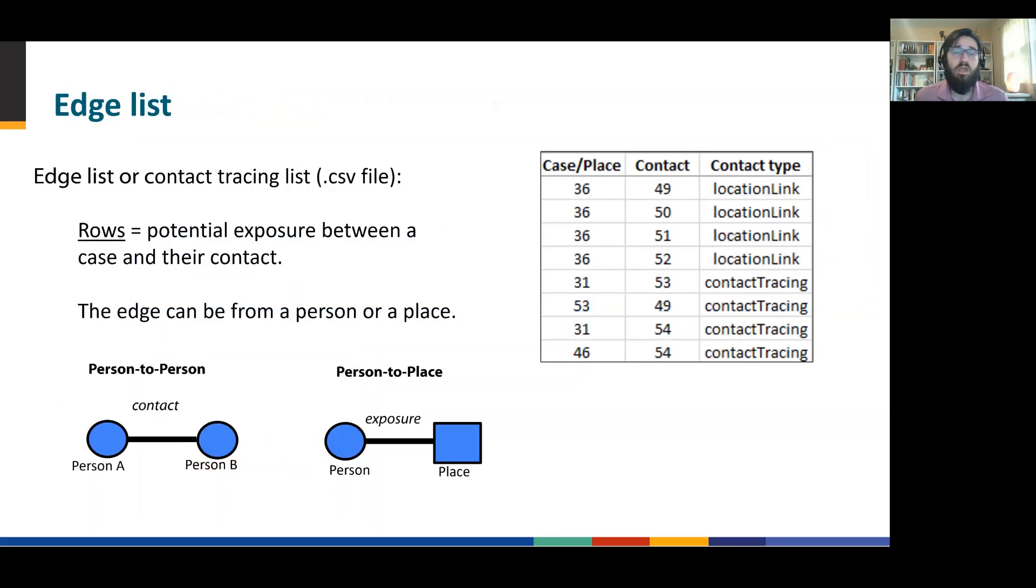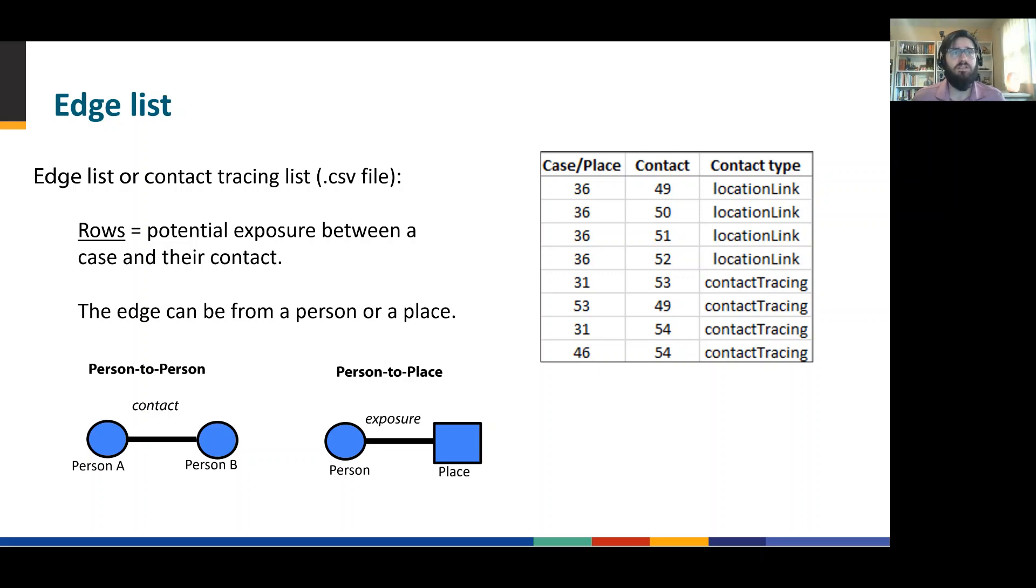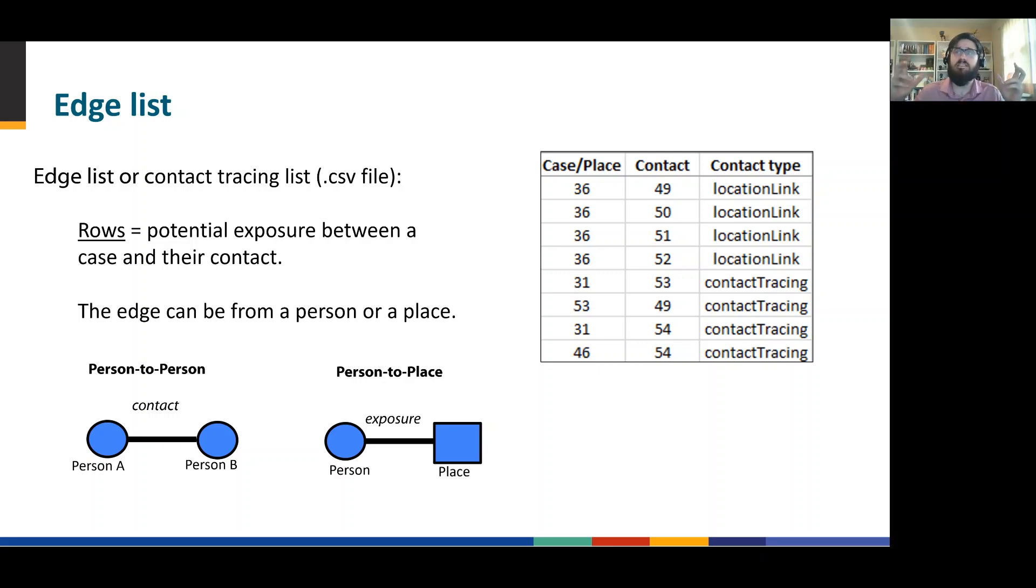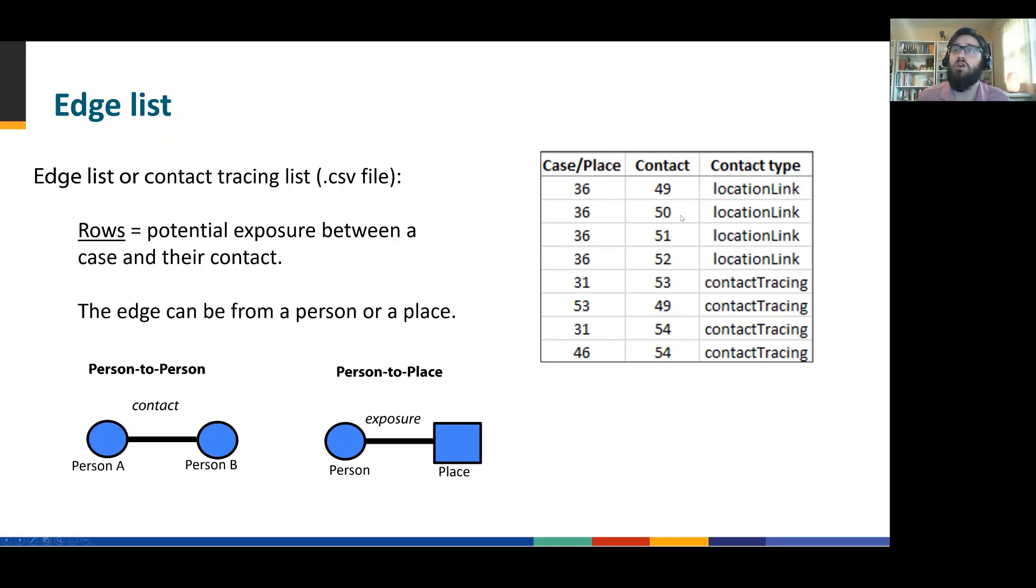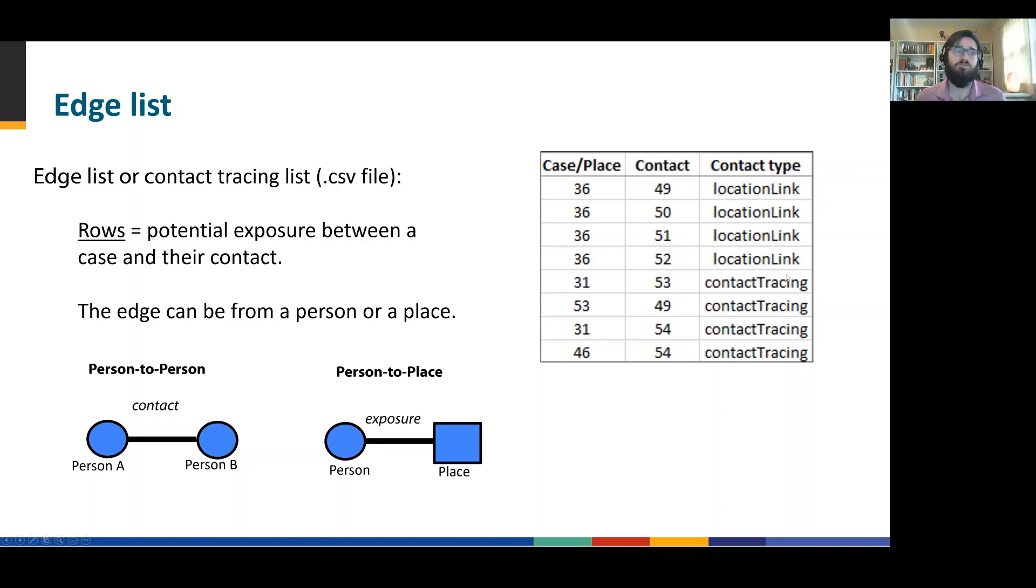The way that is mapped is with what we call an edge list or a link list. An edge list is a contact tracing list. It's really just person A's ID, person B's ID, and then the type of contact that may be. One of those may not be a person. It may be person to place. And if so, you may want to encode that information as an additional column here. You can see we have contact types indicating both contact tracing and person to place links.